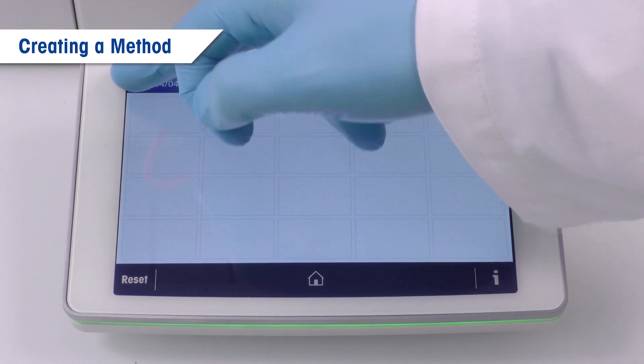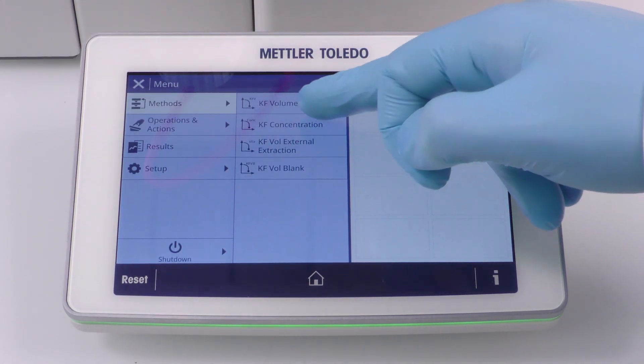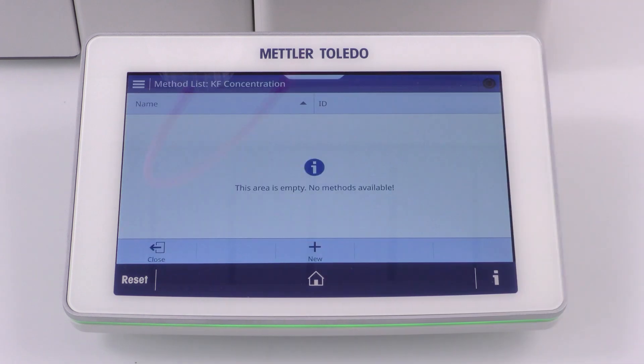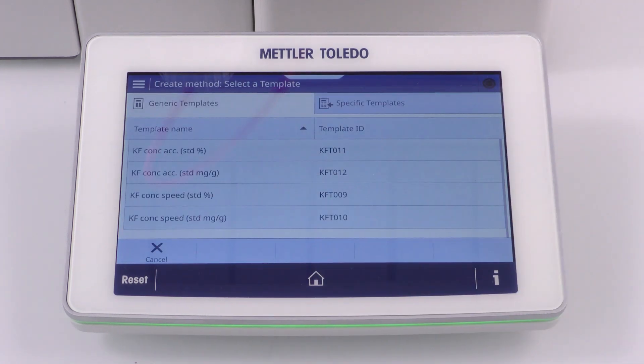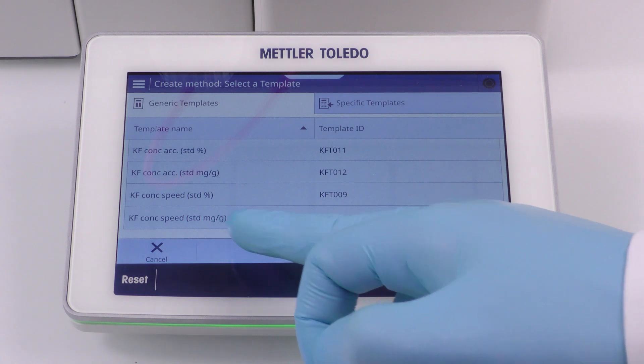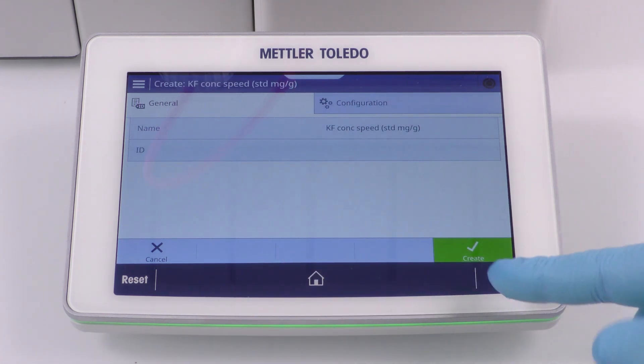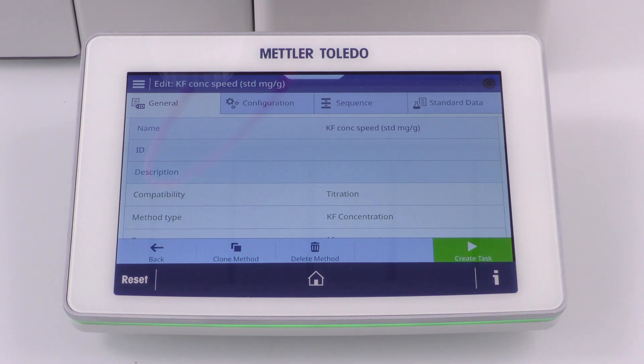We are now ready to create the method for the titrant concentration determination. Choose a template for a standard defined in mg per gram. Give it the name or ID and save it. In our example, we do not need to configure the method any further. For more information on method configuration and on all method parameters, please consult the reference manual.